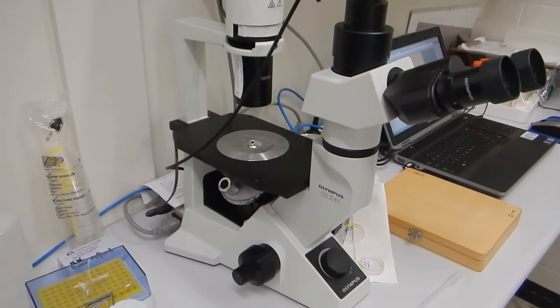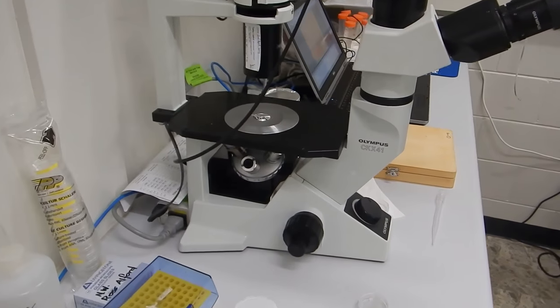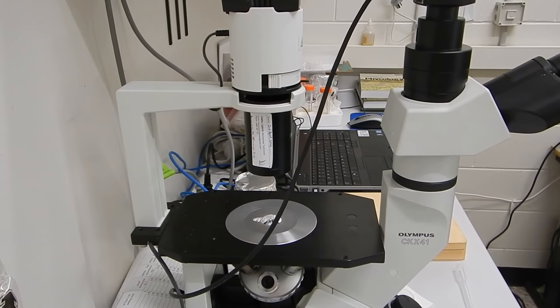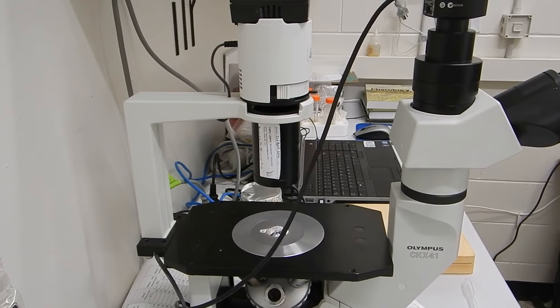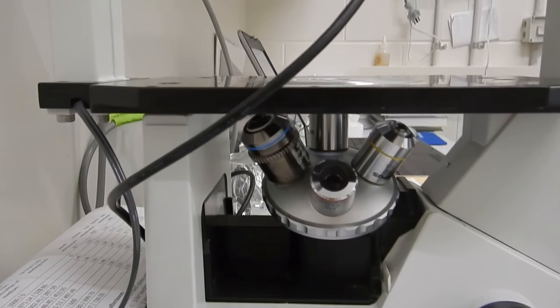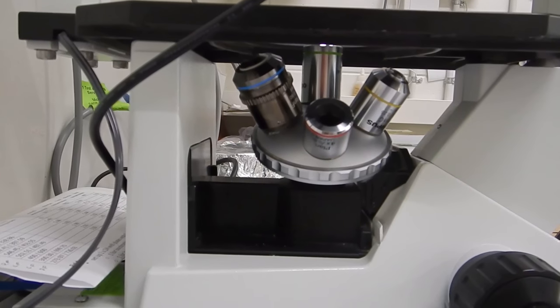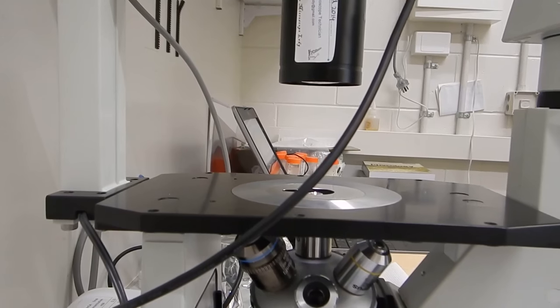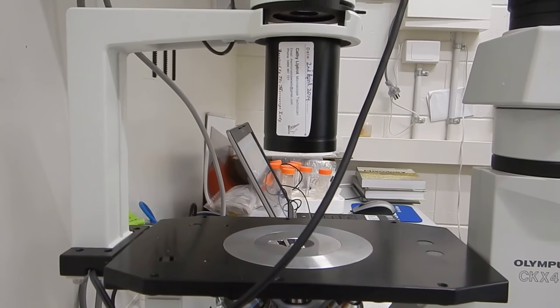Over here is an inverted microscope. Normally microscopes have a lens on top looking down at a specimen with light shining through, but here the lenses are on the bottom pointing upwards. The specimen goes there, and the light's on top shining down.